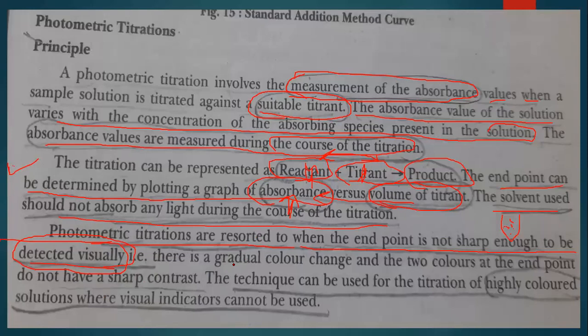Now there is a gradual color change and the two colors at the end point sometimes do not have sharp contrast. The technique can be used for the titration of highly colored solutions where the visual indicator cannot be used. There you can use this technique.